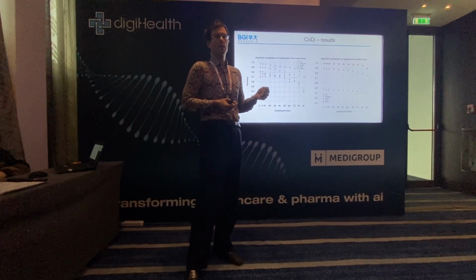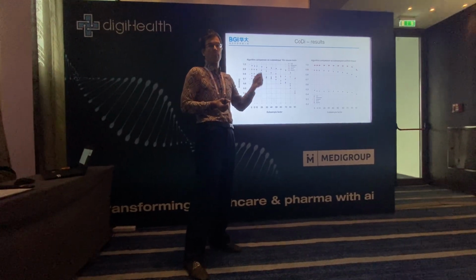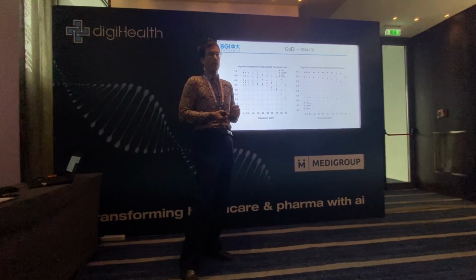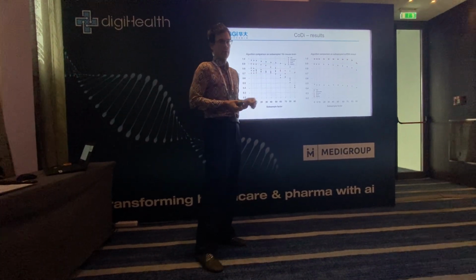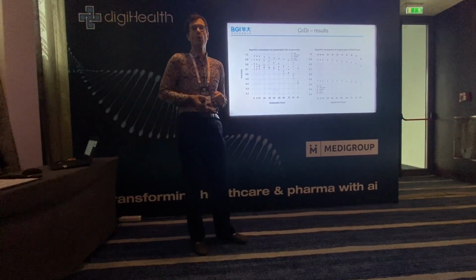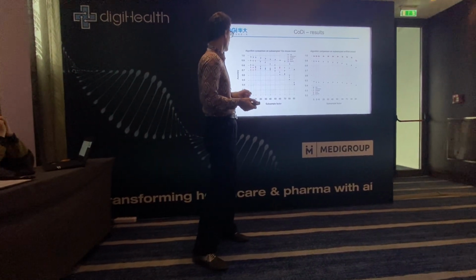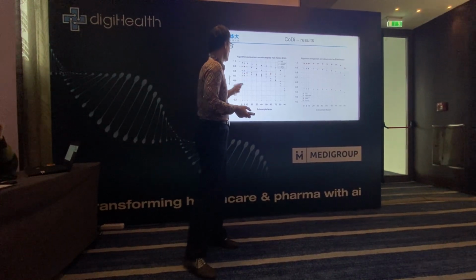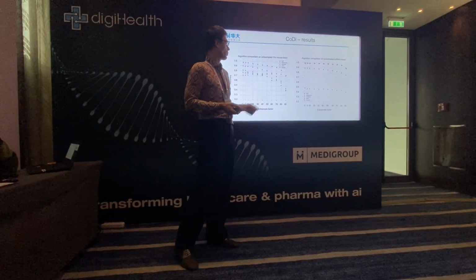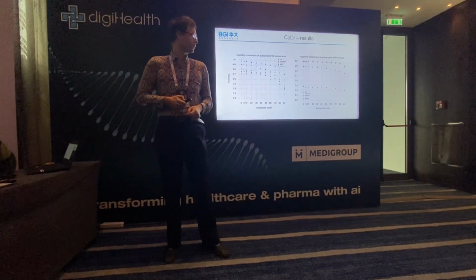So we annotate it, and we already know what the annotations are because they are the same as in the single cell. And we tested it against different tools that are available and mostly used for cell type annotation with the reference, and we managed to obtain the highest accuracy on almost all subsampling factors.